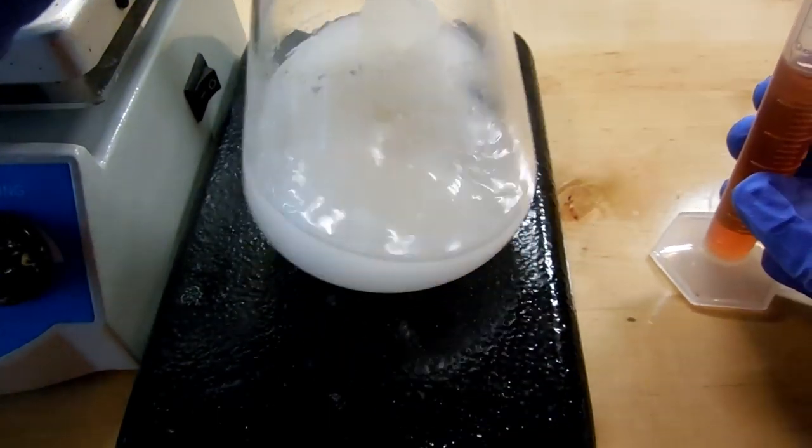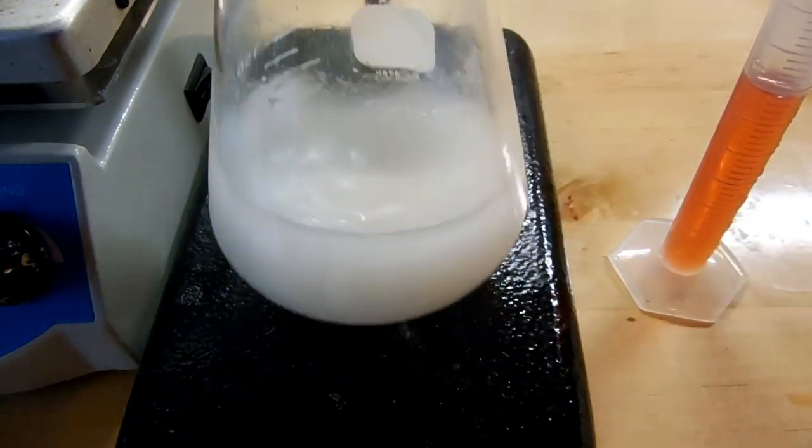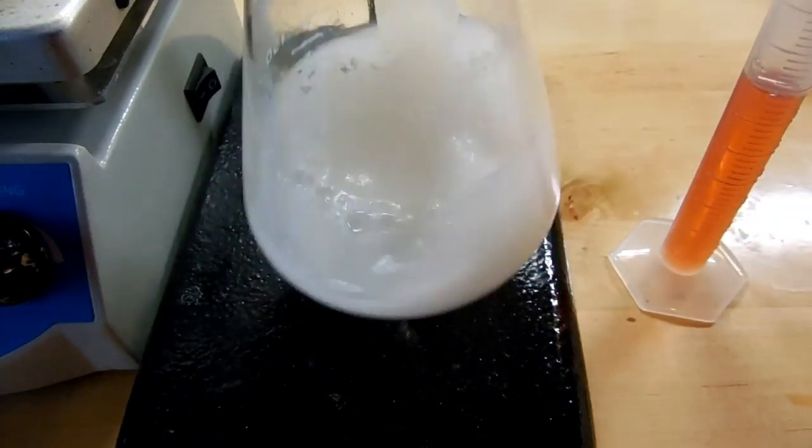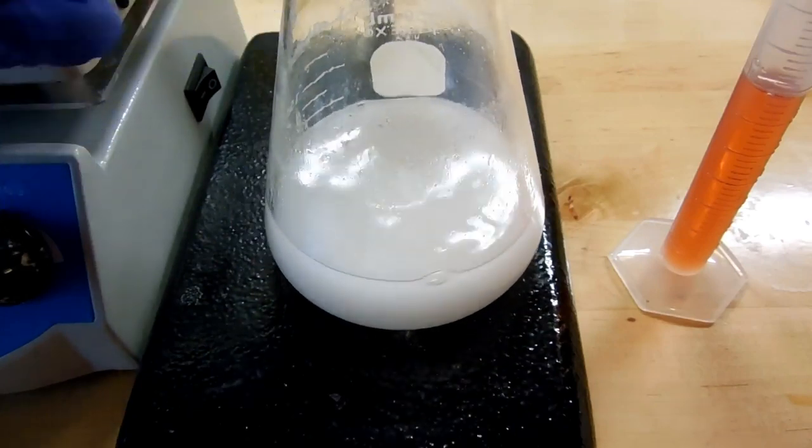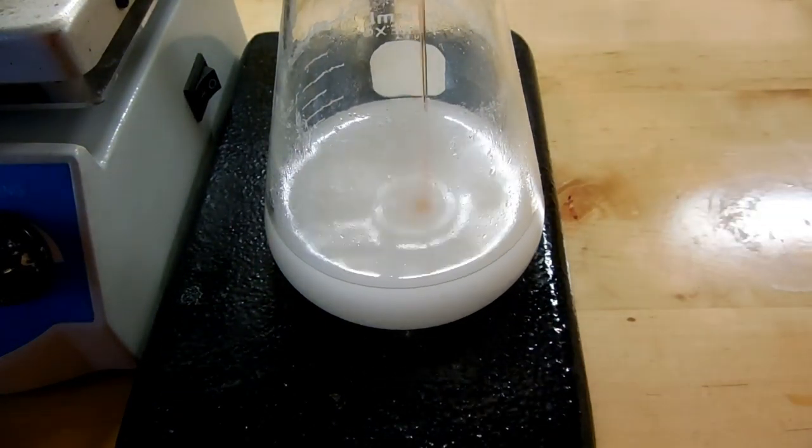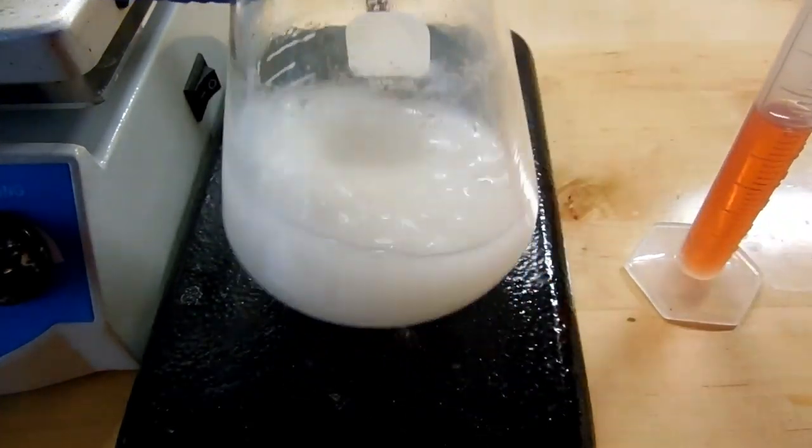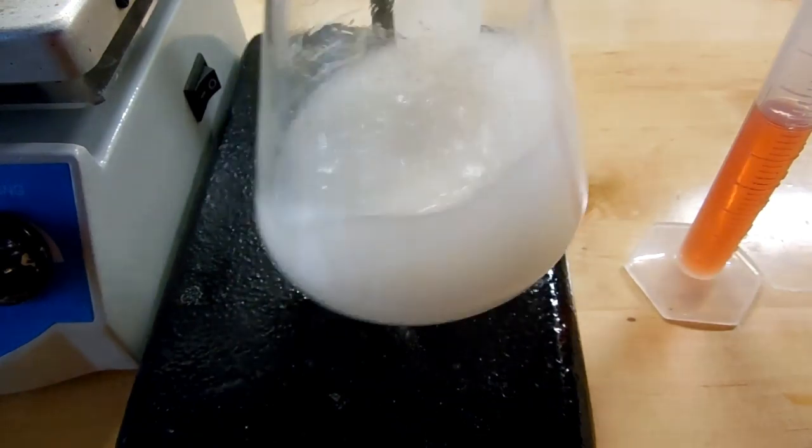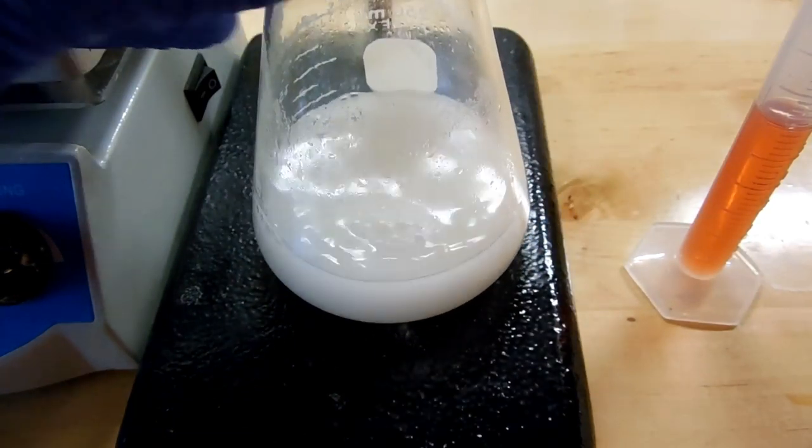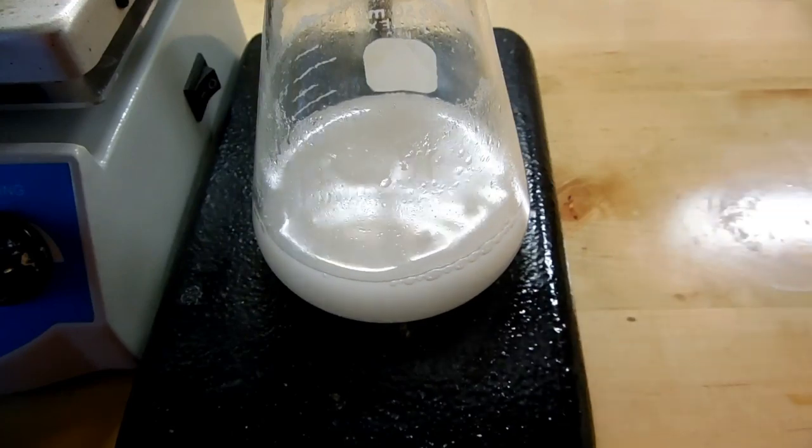Every time I add acid it produces more bubbles than you would expect from just pouring one liquid into another. That's because it's actually making localized boiling right where I pour it. The original procedure called for 10 milliliters of acid but since it's a catalyst I dropped that to 8. My acid is red because it's drain cleaner grade with dye or dissolved carbon.